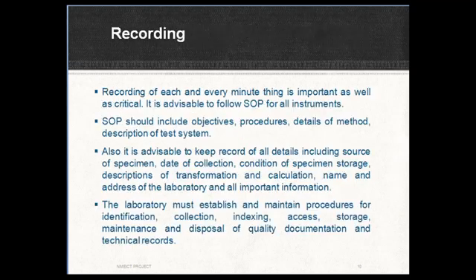Now let's try to understand about the recording. Recording of each and every minute thing is important as well as critical. It is advisable to follow SOP for all instruments. SOP should include objectives, procedures, details of the methods, description of test systems.